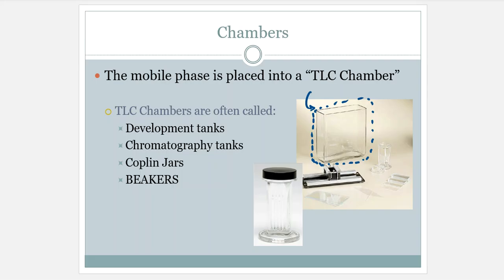Here is another option of a tank, and I'm circling that now. And this is really for smaller plates, of course, a 10 centimeter, 20 centimeter plate cannot go in those little bitty things. But those are great for microscope slides. So we've got plates that look very similar to a microscope size, and they are covered in silica or alumina.